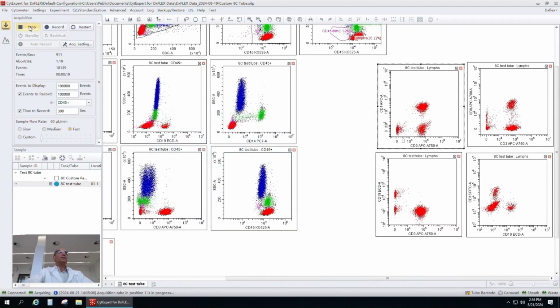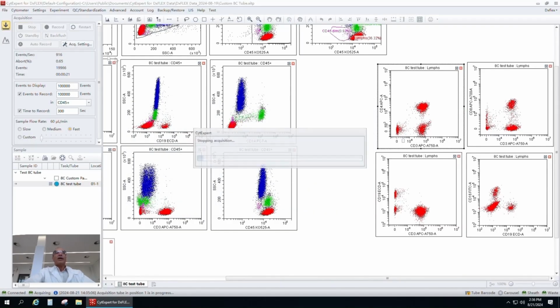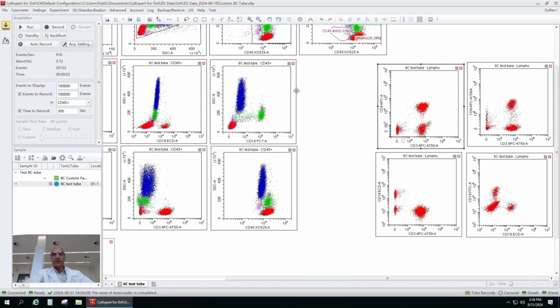So let's stop here. So remember, for ClearLab 10C application, specimen by specimen compensation settings is not recommended. Once the system is standardized and verified, any deviation from expected pattern should be investigated to determine the appropriate remediation. This is really a very nice, unique feature.